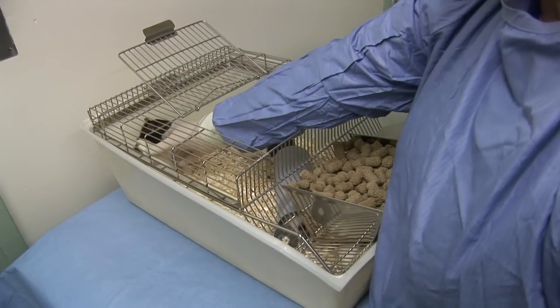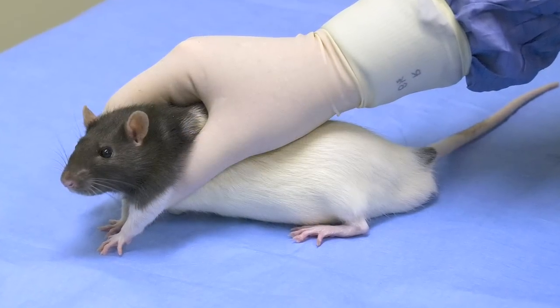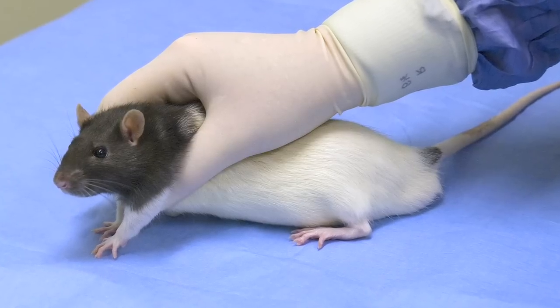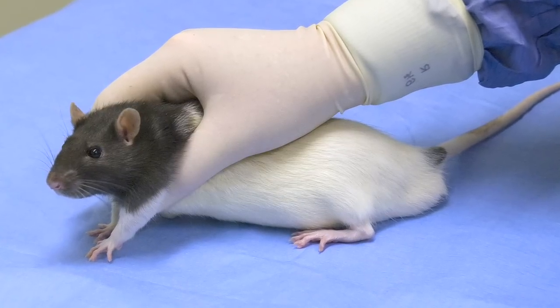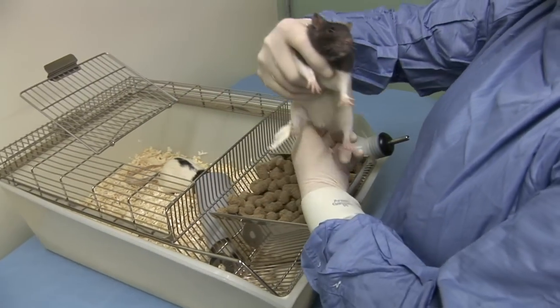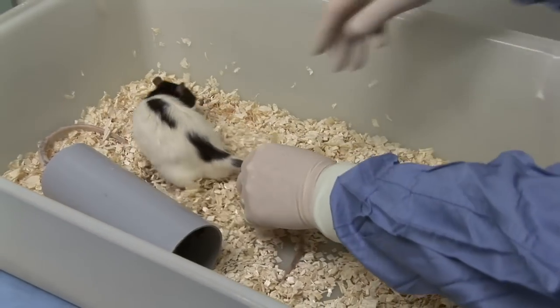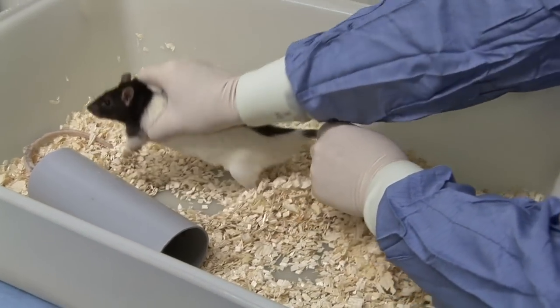The first rat to be injected should then be restrained smoothly without hesitation by grasping the animal around its shoulders. The rat should then be lifted from the floor of the cage onto your arm or onto the cage lid. If the animal is very active, it can be restrained by holding the base of its tail before picking it up around the shoulders.